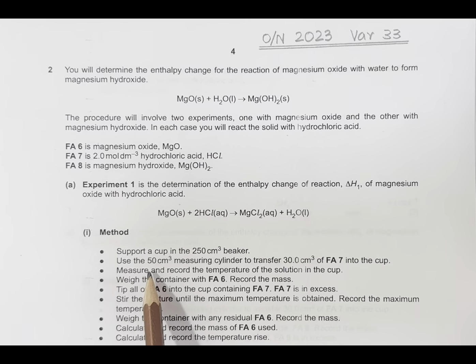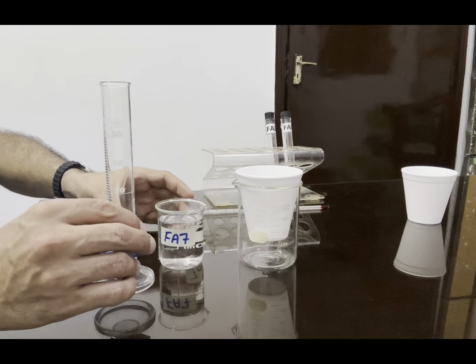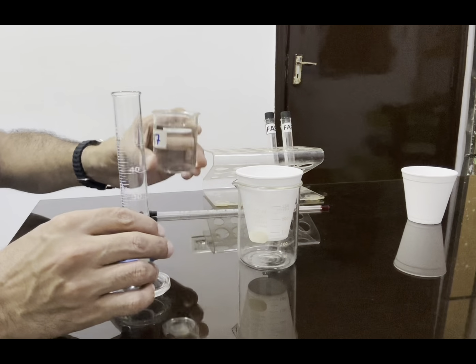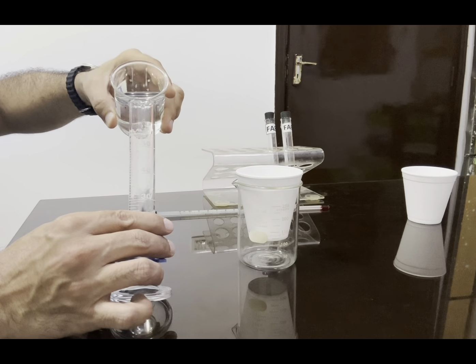Measure and record the temperature of the solution in the cup. So it's 30 cm³ of FA7 transferred into the plastic cup.